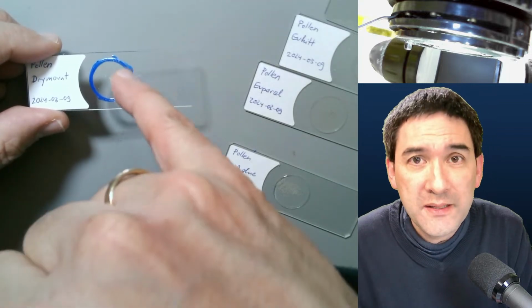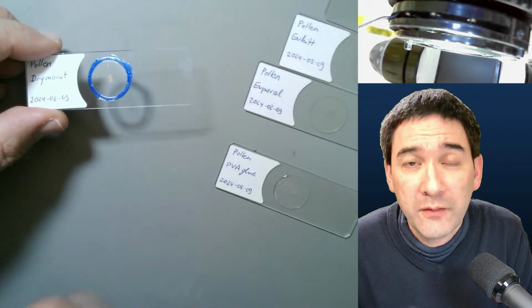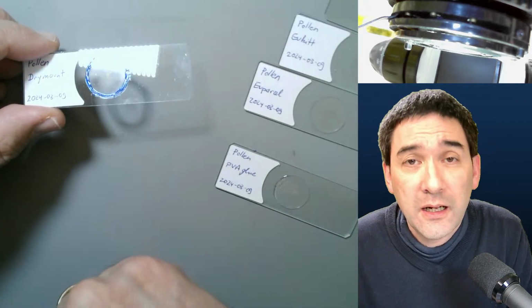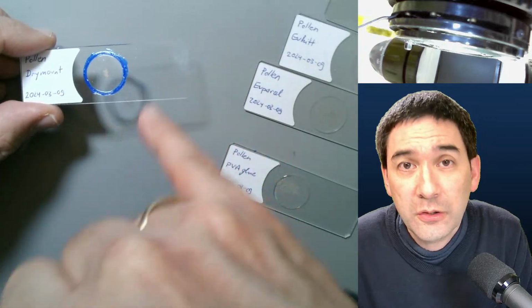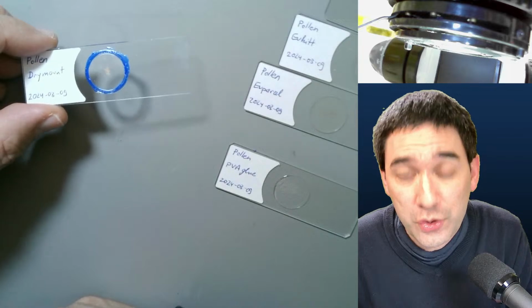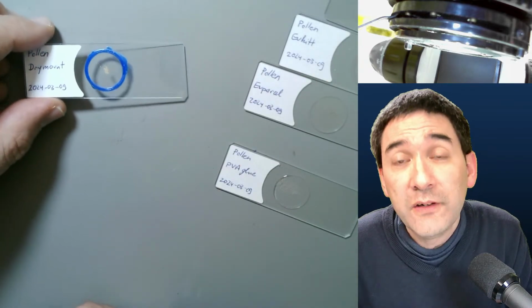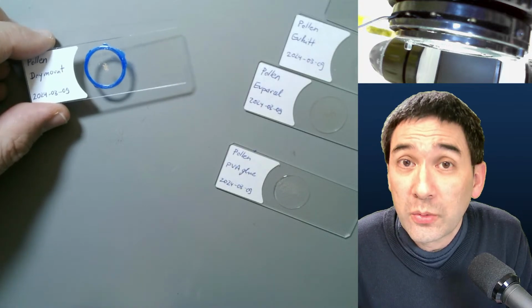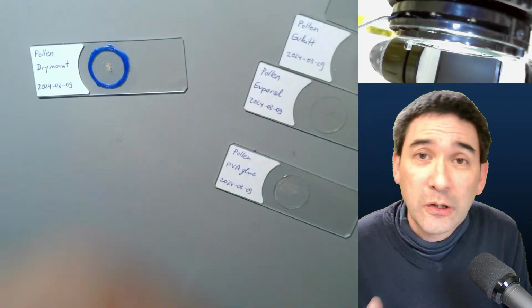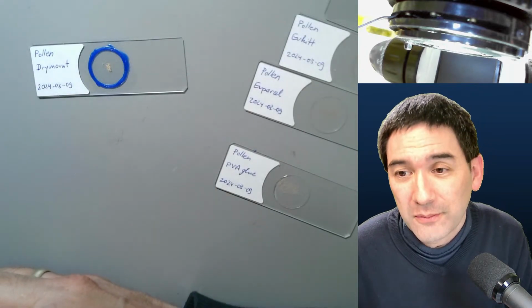And then you basically put a drop of the liquid on here. You allow the crystals to form, the water to dry, and then you put a cover glass on top again, which you also glue on with some nail polish. So the blue ring that you see here, that is nail polish, right? So what you have is essentially a dry mount of the crystals, and very often this will actually look quite fine because between the crystals and the surrounding air, there's a large difference in refractive index again, which allows you to see it better.